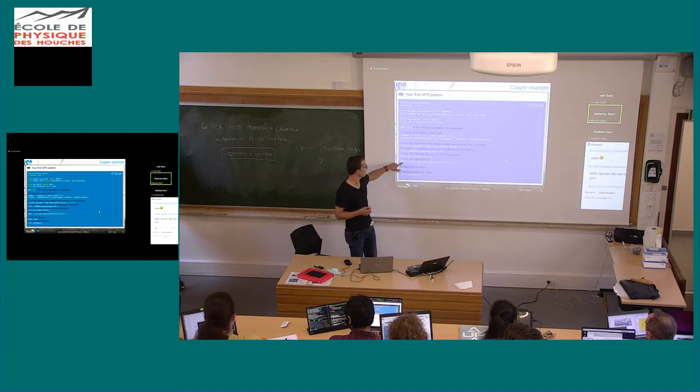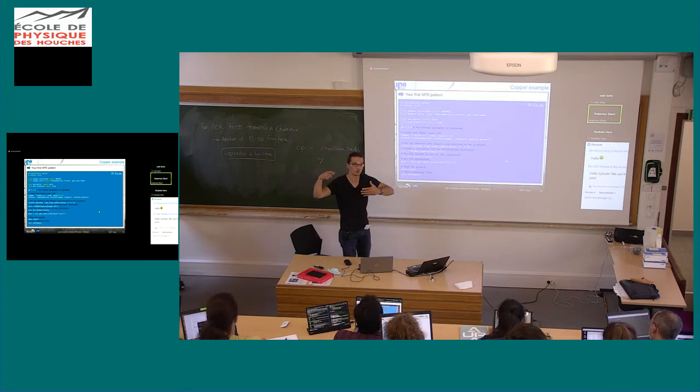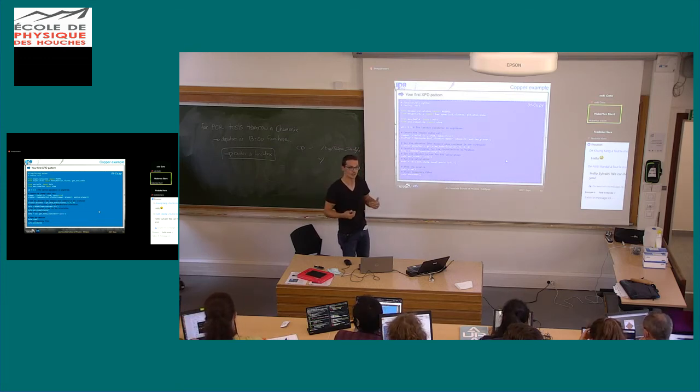And then you will have, as an output, a data object which will contain all the results. This object is a special Python object, so this is not a simple list or an array or a dictionary. No, this is a bundle object, because you may have different scans inside the same object. But you can view it graphically. So you just have to write data.view, and it will pop up a graphical window with the graph inside, and you can have all your parameters. You can export the data, save the data, print the data, etc.